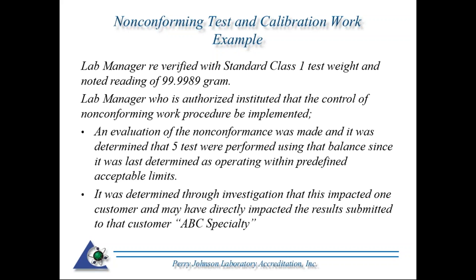So in this particular scenario, an evaluation, of course, was done. This would be for all work that was done. In this case, we're looking at a week since the balance was last determined to be operating within predefined limits. The evaluation determined that 5 tests were performed using that balance since it was last determined as operating within predefined acceptable limits. How many of these 5 did this actually impact? We need to determine that through our investigation. It was determined in this scenario that this impacted one customer and may have directly impacted the results submitted to that customer. In this scenario, a fictitious ABC Specialty is specified as this customer.